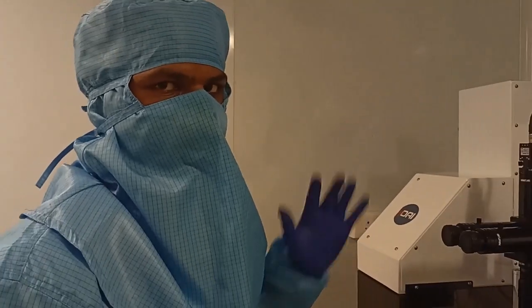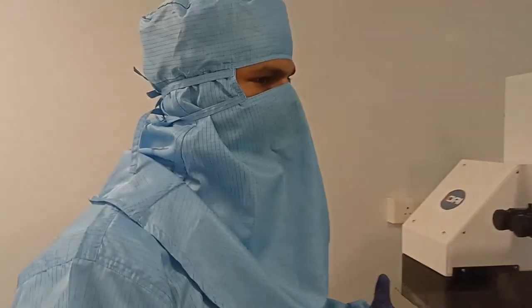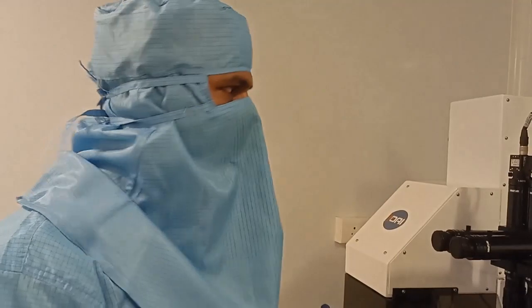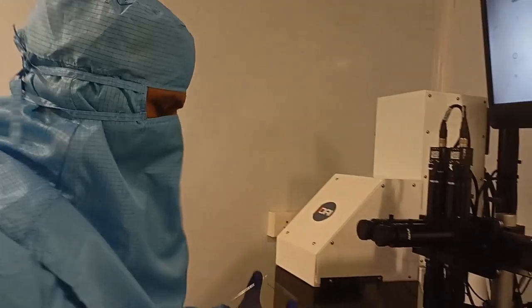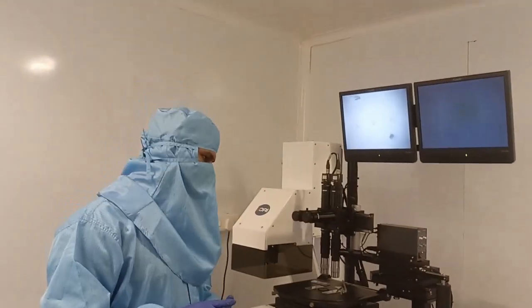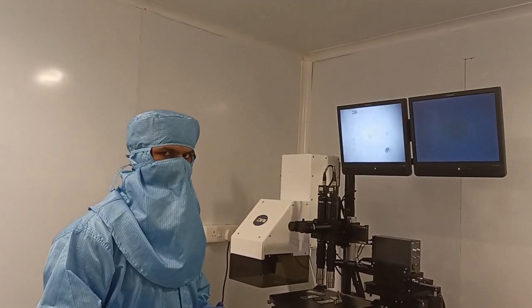What is the dimension? The dimensions are different, you can see many structures of different dimensions. The minimum dimension is 80 micron, as seen on the screen. How small a structure can be made using this machine? Not smaller than 500 nanometer.